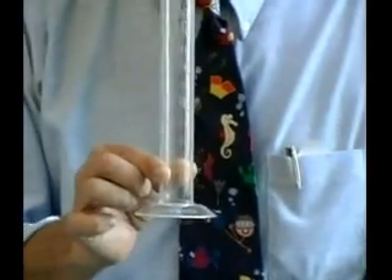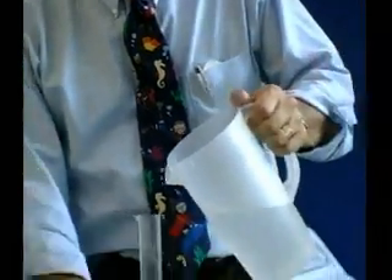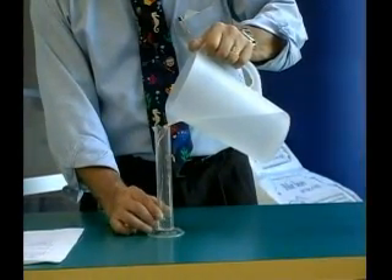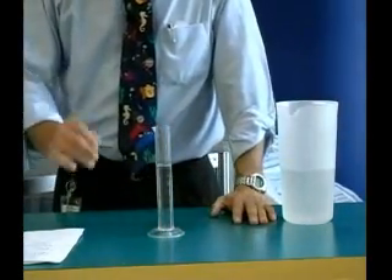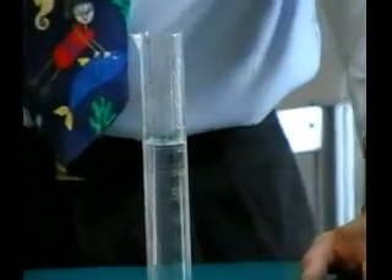When we measure this, like I'm going to do right here, we carefully pour a liquid in the graduated cylinder and then we take a reading. It's important that it is flat, and you want to take your reading down low, right where the water level is.